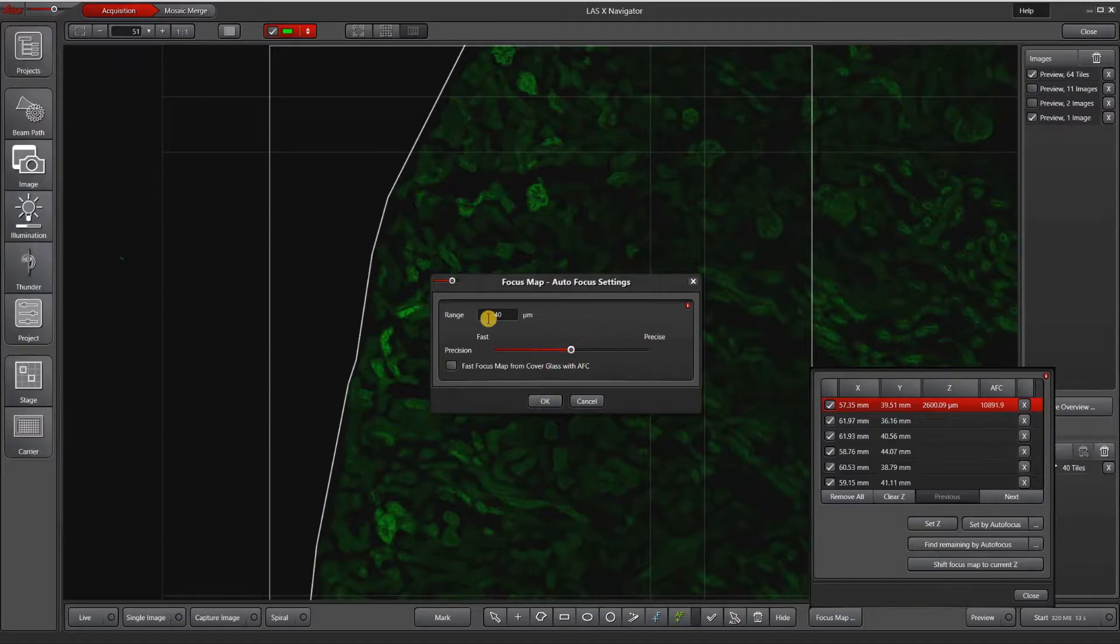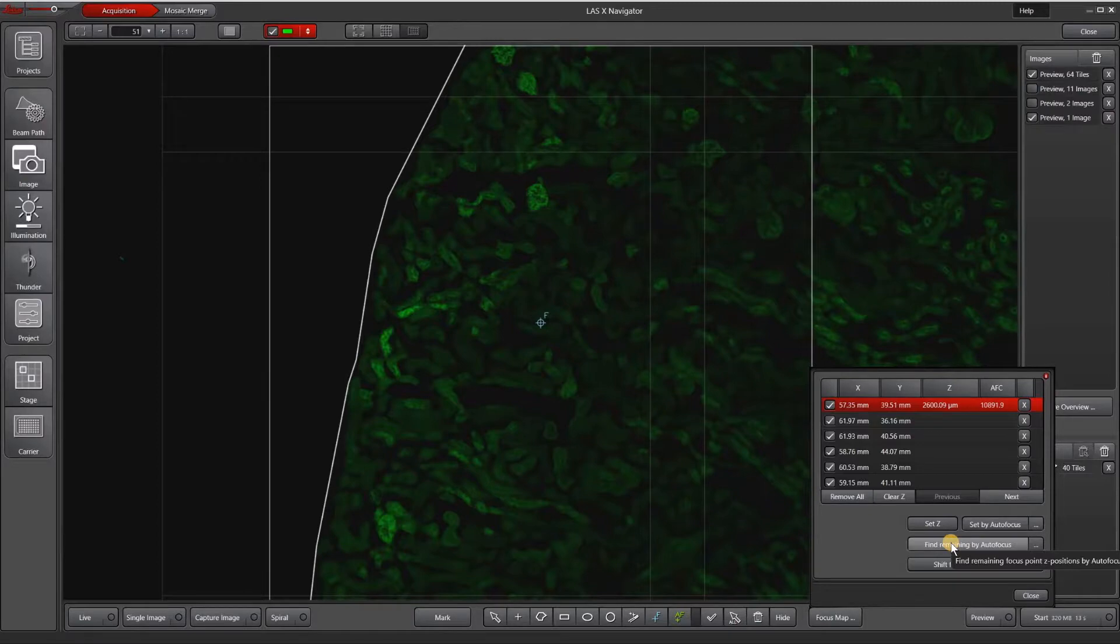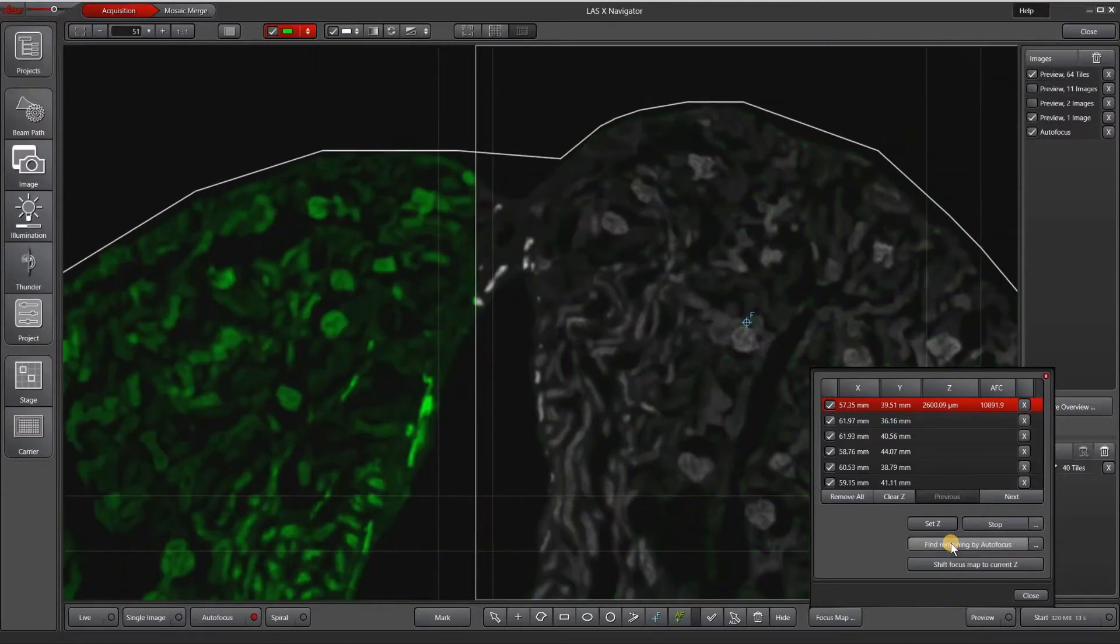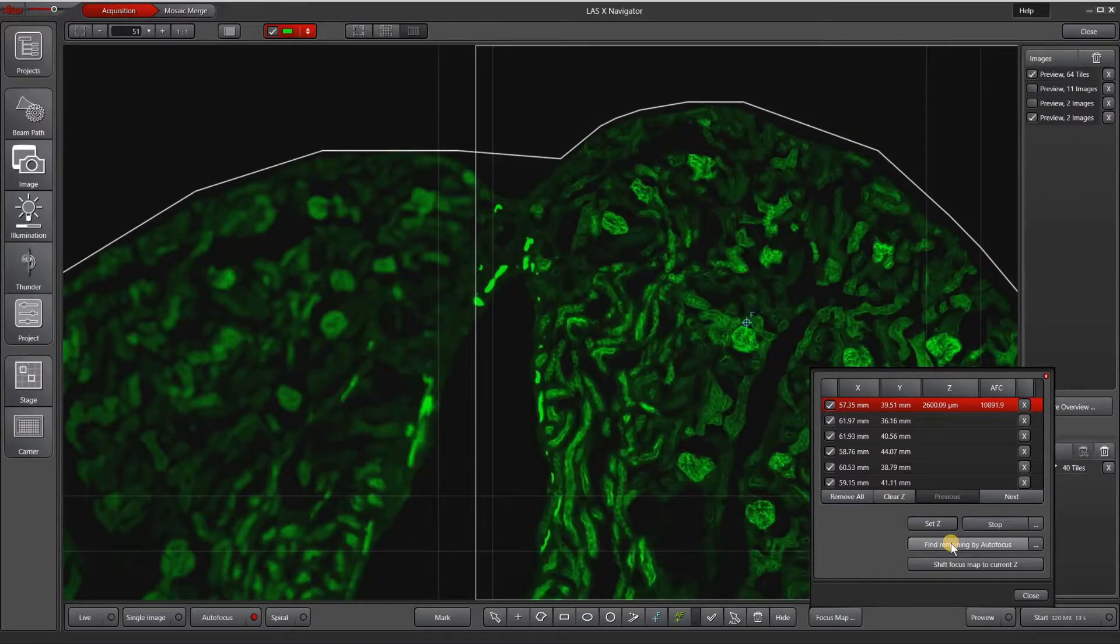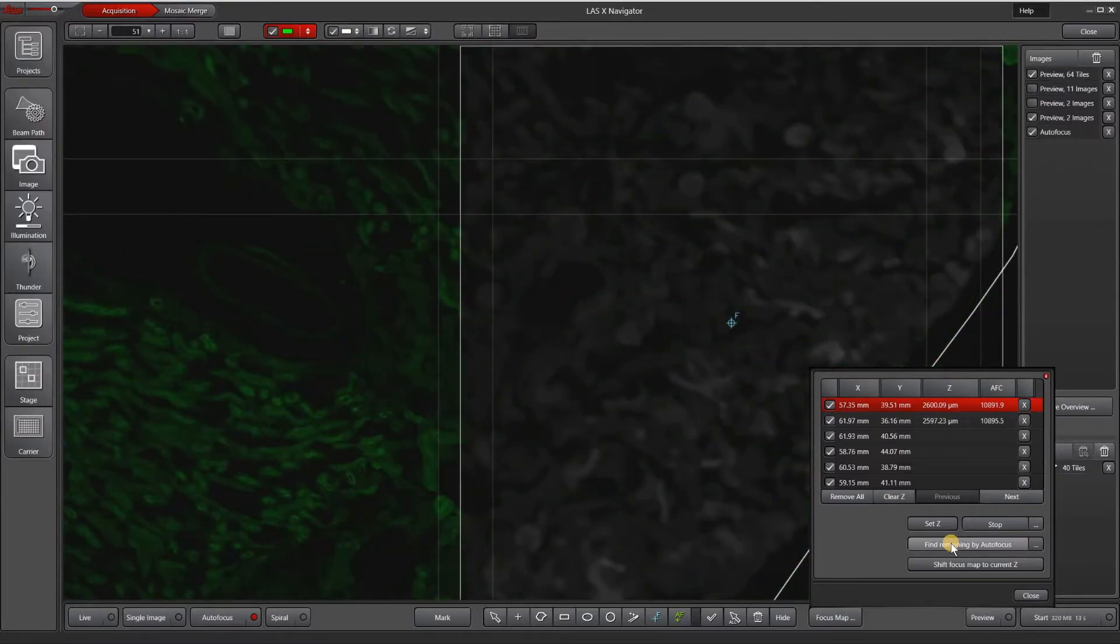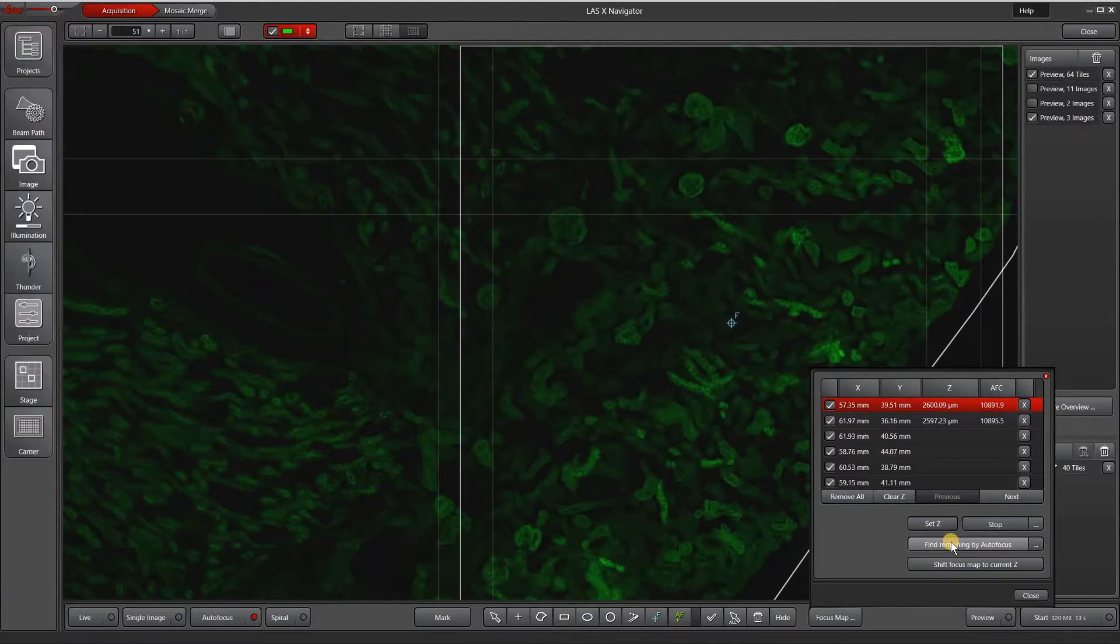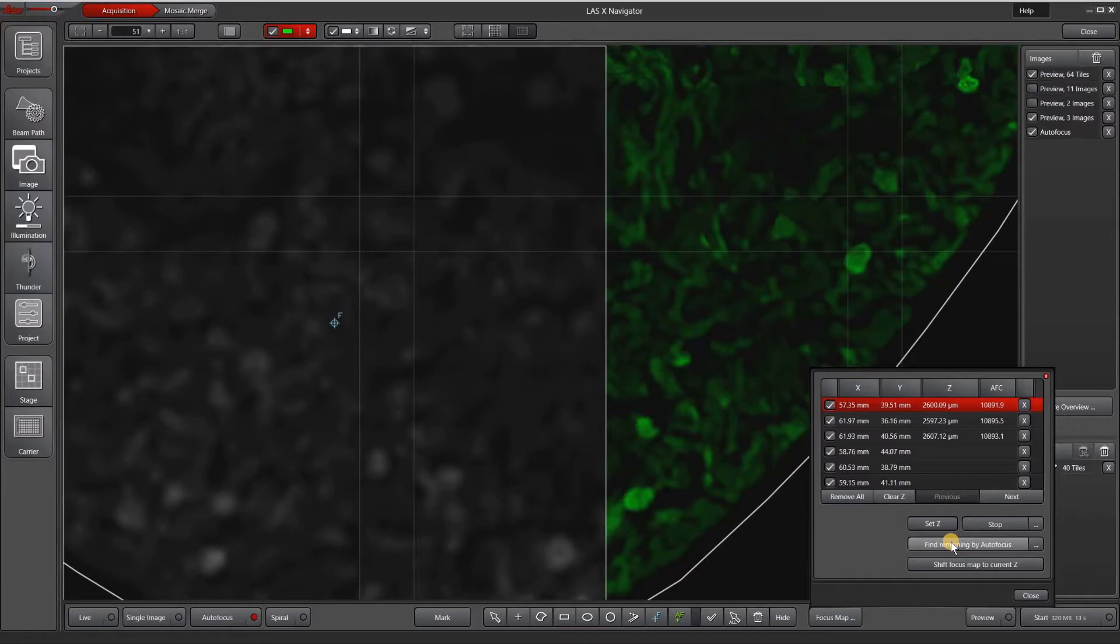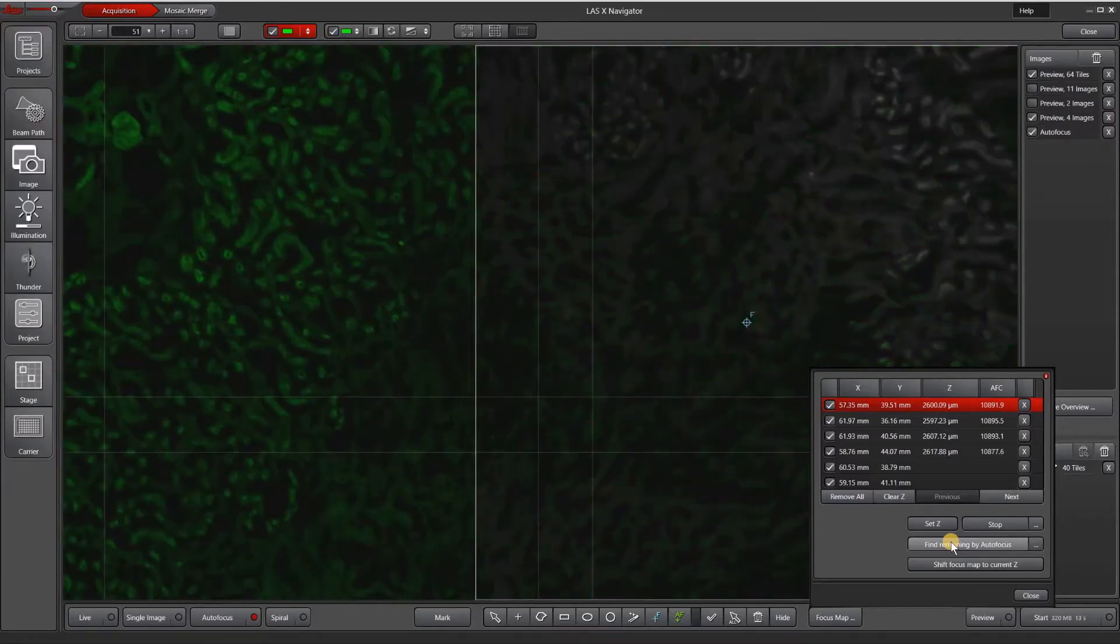You may need to adjust these settings depending on your sample. When I'm happy with my settings, I will hit find remaining by autofocus and it will visit each of the focus map points and run a little Z stack and return what it thinks is in focus. It's not a bad idea to sit and watch this happen to make sure that you are happy with the focus that it's decided for your image.